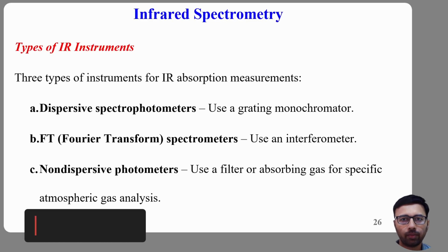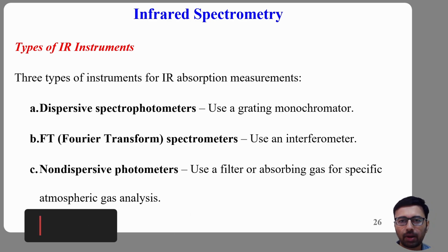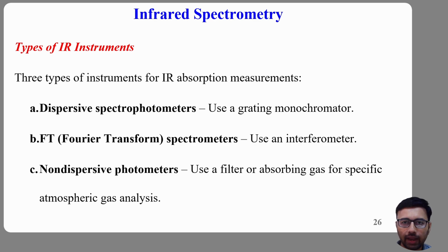Hello, everyone, and welcome back to our series on vibrational spectroscopy. So far, we have focused primarily on the theory behind infrared absorption. We discussed molecular vibrations, group frequencies, Franck-Condon transitions, vibrational progressions, and the factors that shift vibrational frequencies. But now it is time to move from theory into instrumentation.